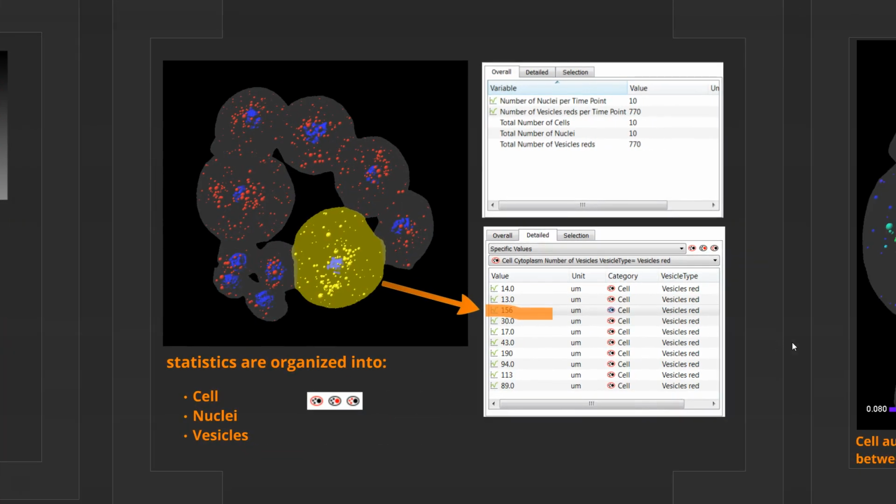So once you've identified the compartments of interest, it will then split all of your cells. Typically, when you are working with multiple cells, they are very close to one another, so we have multiple splitting algorithms. And then the statistics, as I said, are produced on a cell-by-cell basis. So if you're looking at counts or nuclear volume or intensities, it's all done on a cell-by-cell basis.